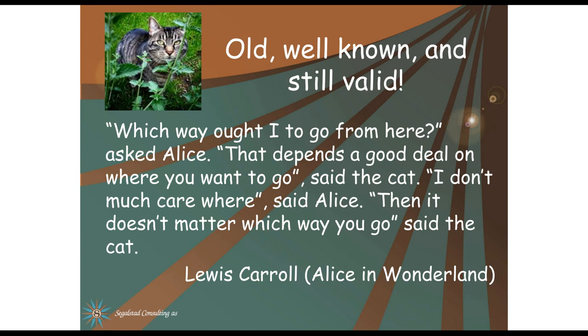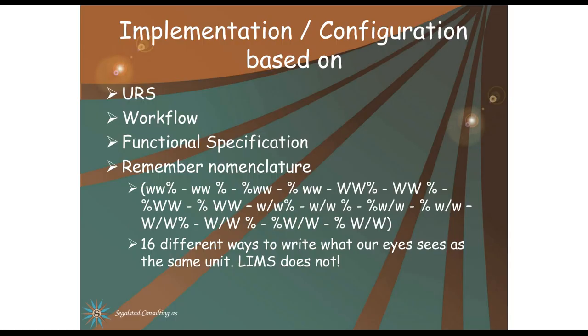I think this is also very true for a LIMS implementation, and not the least for selecting a LIMS. If you don't state what your needs are, then you will not get what you want. Most of the large LIMSs have been available for a long time and will be okay for your purposes. They are not all that different, but you need to make it work the way it should. Thinking of data integrity from the very beginning of the implementation phase is important.